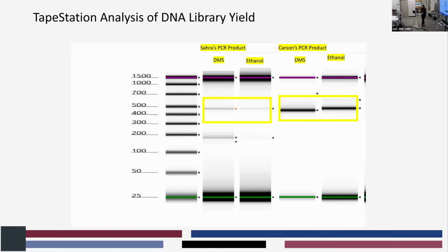For the rest of my research project, I tried to troubleshoot and see where the problem was. So I started with the PCR steps. I worked backward through the workflow.